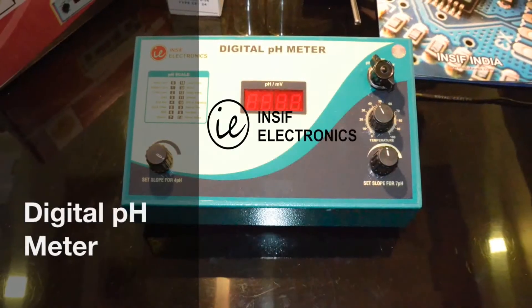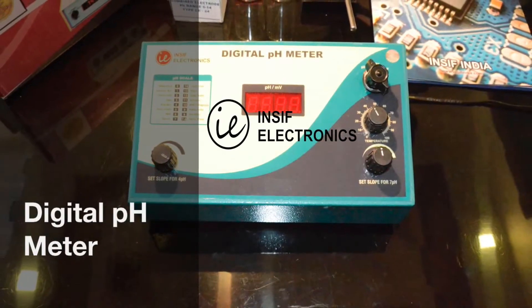Hi, this video is to show how to calibrate a digital pH meter.